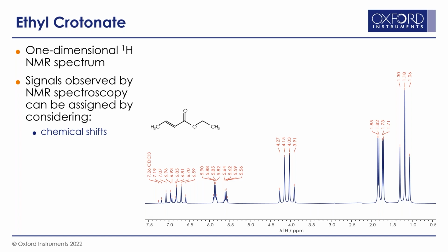The relevant chemical shift range is dependent on the nuclei and choice of reference compound. For proton NMR spectra, where 0 ppm corresponds to the signal of tetramethylsilane, or TMS, the majority of signals for diamagnetic, organic, and organometallic compounds fall within a range of +15 to -5 ppm. The chemical shift of a signal corresponds to the local chemical environment within the molecule. In this case, there are signals corresponding to saturated hydrocarbons, esters, and vinylic protons, corresponding with the chemical environments in the ethyl crotonate molecule.